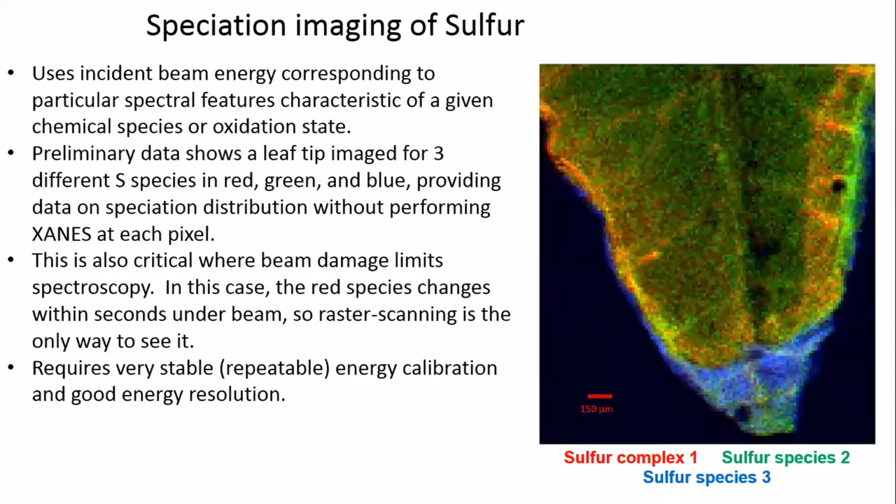Right. Okay. And what kind of sulfur concentrations are we talking about here where you can collect the scan in 30 seconds? Well, a 30-second scan is a little bit noisy, so we would normally do 10 or 20 of them. This is a biological sample, so probably on the order of 1,000 ppm or 2,000 ppm in a light matrix. So it's not a very weak signal, but it's not high concentration either.